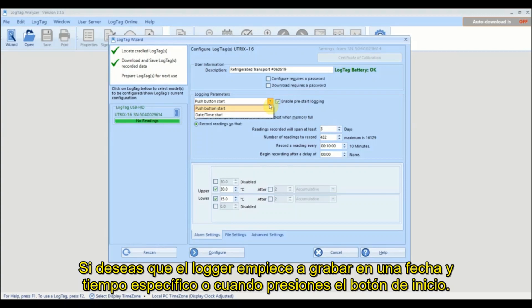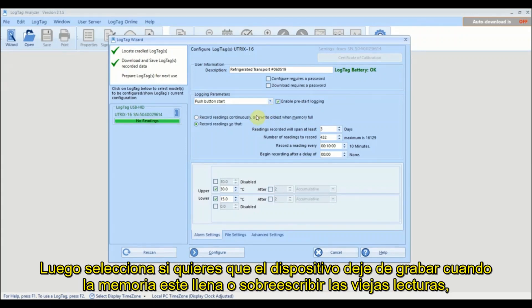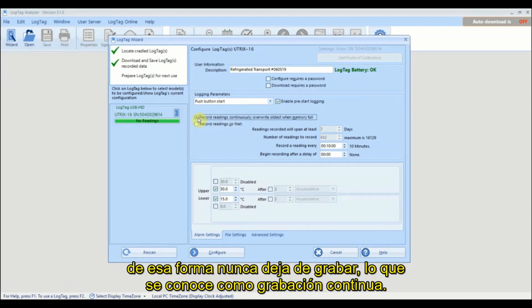Select if you wish the logger to start recording at a specific time and date or when you push the start button. Next, select whether you want the logger to stop recording once the memory is full, or to overwrite the oldest reading so logging never stops. This is called continuous recording.